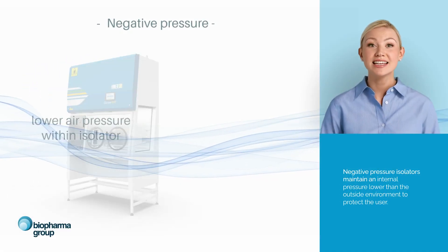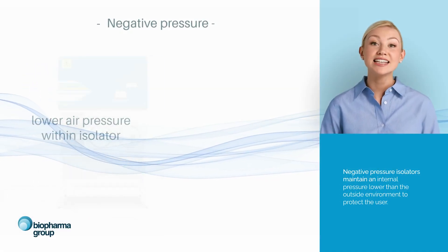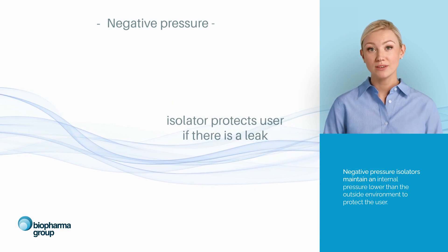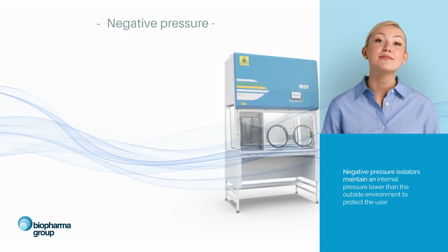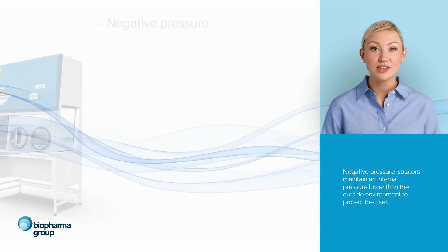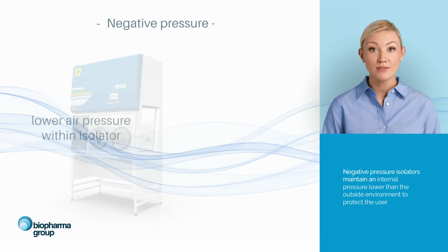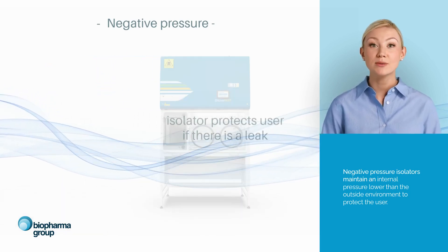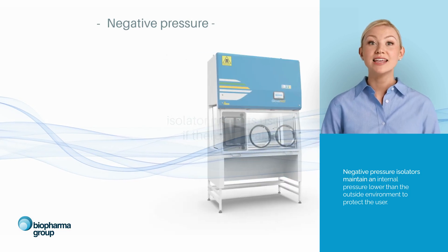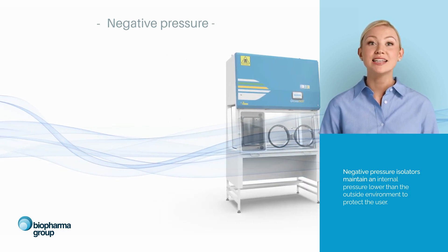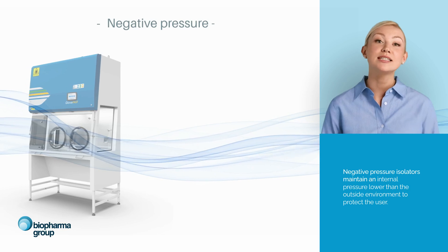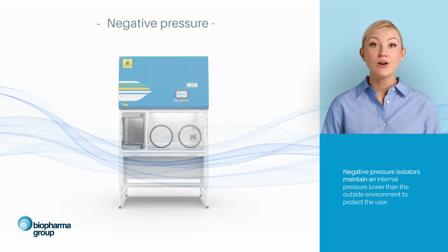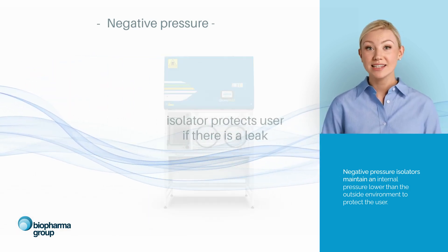Negative pressure isolators maintain an internal pressure lower than the outside laboratory environment. As a result, they can minimize airborne toxins from escaping into the clean room environment, as air will flow into the isolator because of the lower pressure. Negative pressure isolators are designed to protect both the material being manipulated from contamination and the operator from hazardous substances.